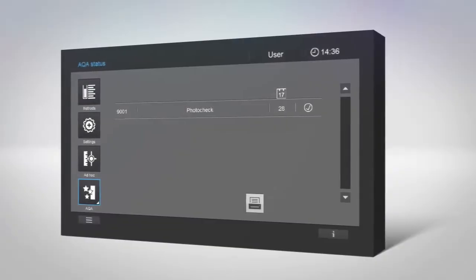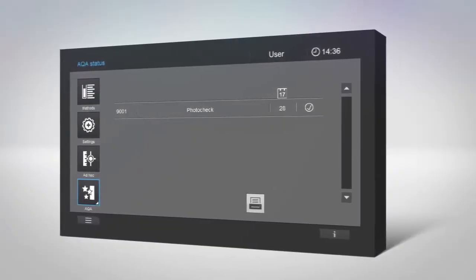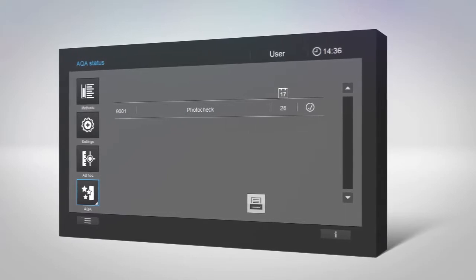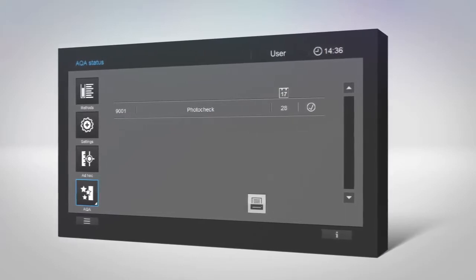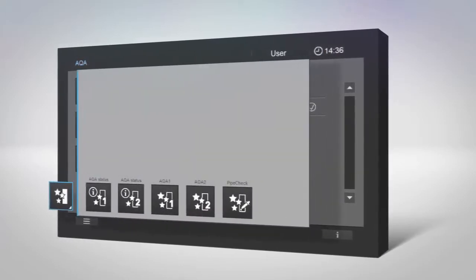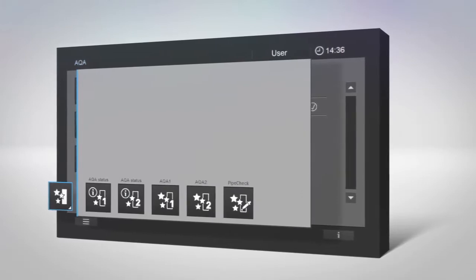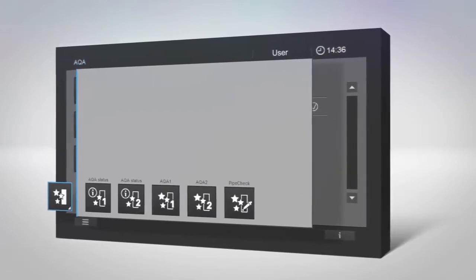AQA Prime makes analytical quality assurance exceptionally secure and extremely easy. Tap the AQA icon for a clear overview of AQA status, information, updates, and options.